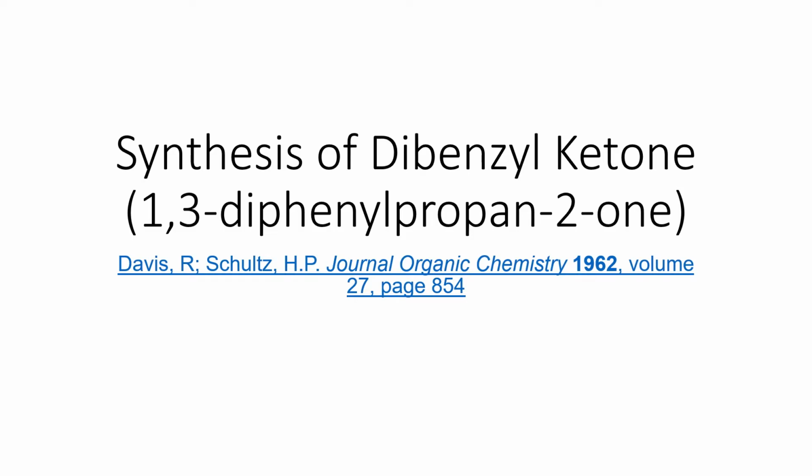Welcome back, everyone. So for this week's experiment, we'll be performing the synthesis of dibenzyl ketone. This synthesis is not found in the lab manuals. Instead, we've provided this journal article here for you guys to reference and understand how this synthesis works.